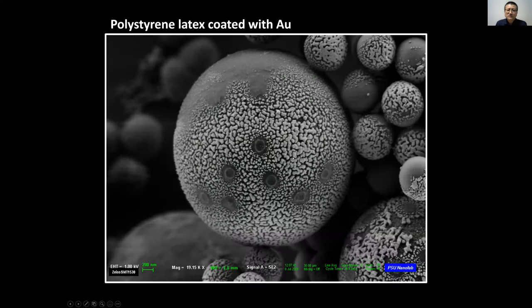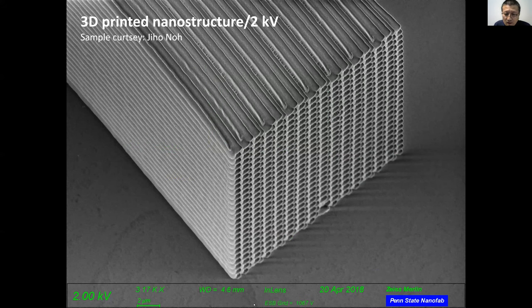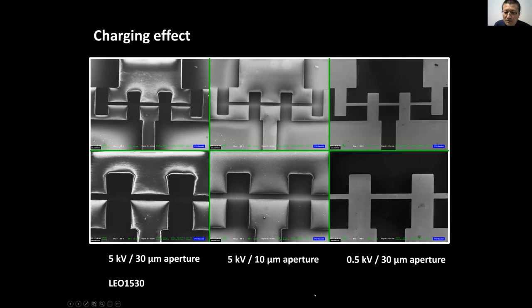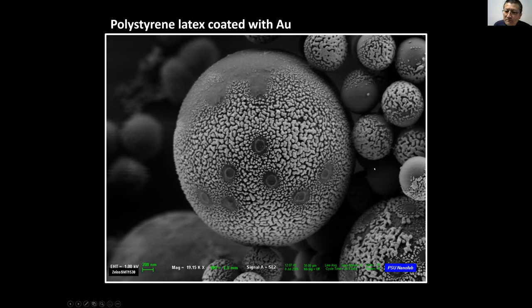This sample has spheres of two different sizes. The user uses smaller spheres to create a surface feature. Notice I'm using a different detector here — SE2 instead of in-lens. SE2 can give you a real sense of three-dimensional topography. In-lens is the most common detector people use and they stick to it, but for some samples you want SE2 to get the topographic information you need.